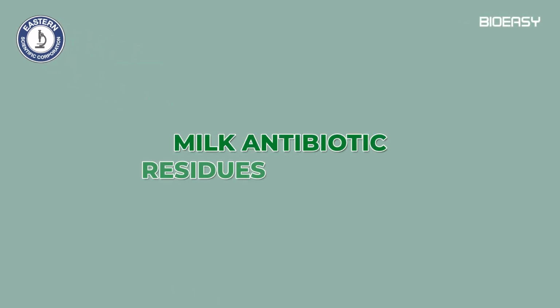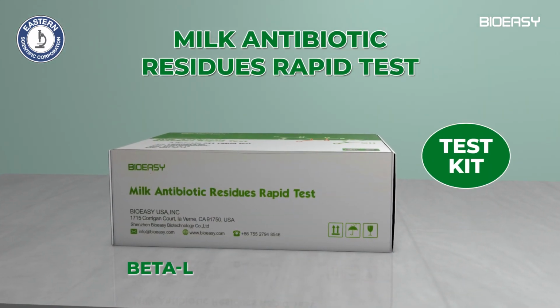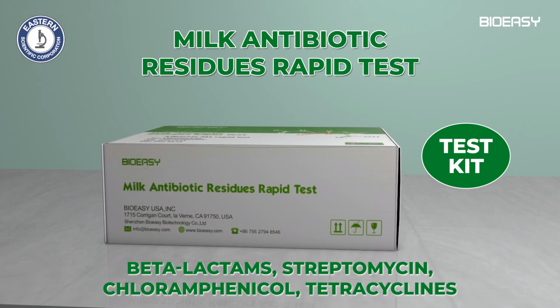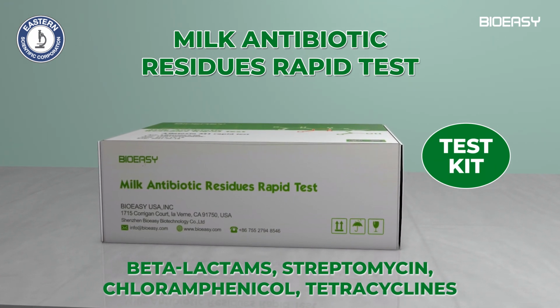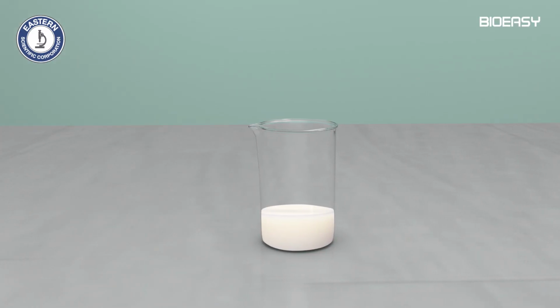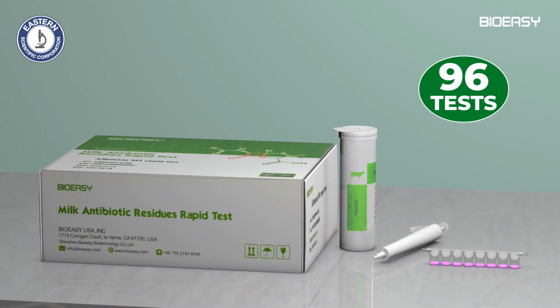Milk antibiotic residues rapid test. This rapid test is used for detection of beta-lactams, streptomycin, chloramphenicol and tetracyclines in milk. It takes about 12 minutes. The milk may be raw, pasteurized or full cream milk powder. 96 tests can be conducted using this kit.